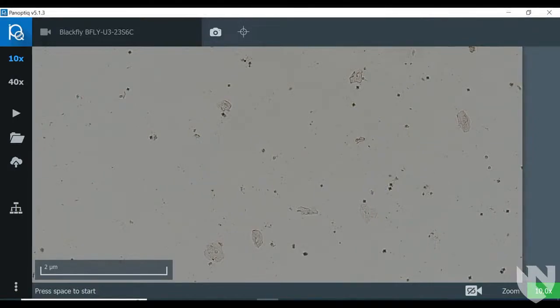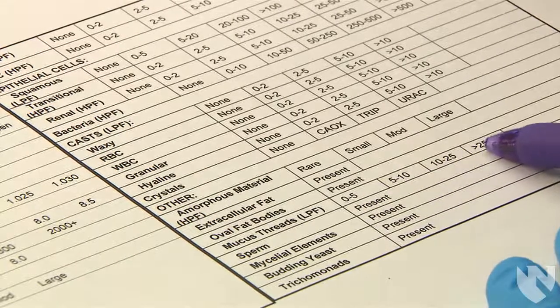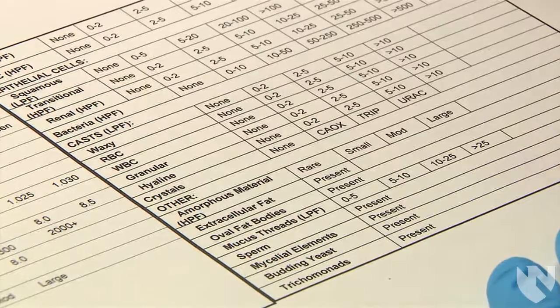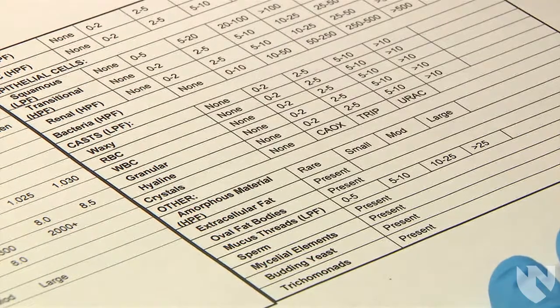Once you have scanned the correct number of fields, take the average number of elements you saw per low power field and document your findings per your laboratory's procedure. We will use the ranges our worksheet gives us.